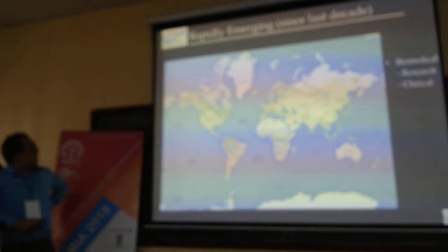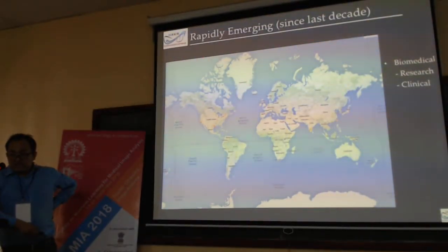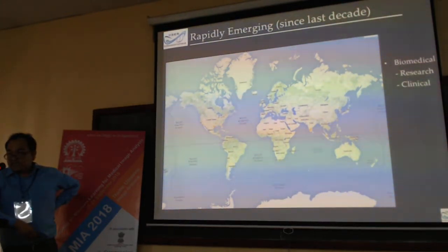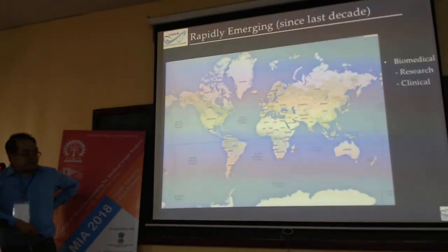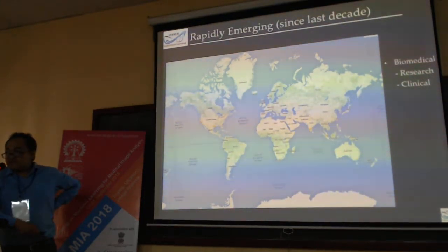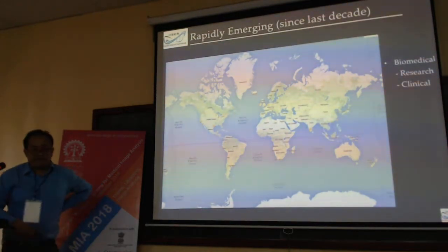Photoacoustic imaging has been rapidly emerging over the last decade. I found that not fewer than 100 research labs are doing this research all around the globe. Unfortunately, in India, nothing other than a numerical approach has yet been reported in the literature.